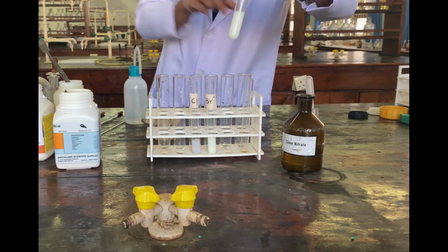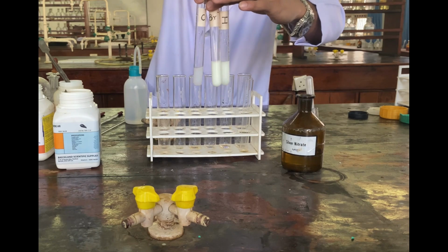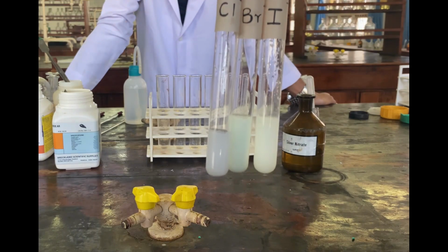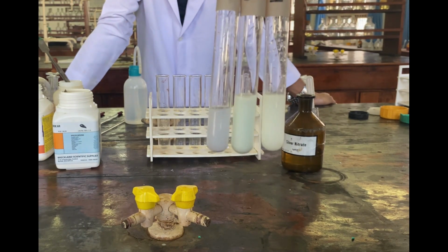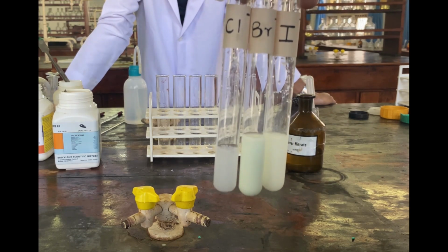We can say that chloride ions with silver nitrate give white color precipitate, bromide ions with silver nitrate give a bit of darker color precipitate, and iodide ions with silver nitrate give a yellowish color precipitate.